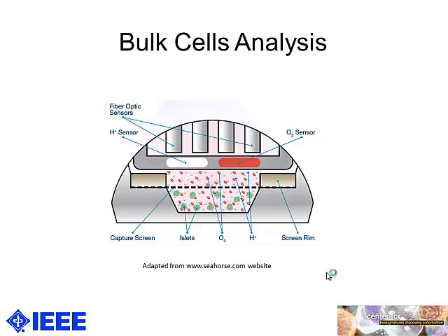This process is carried out with a large population of cells by measuring the parameters of the whole group of the cells and reporting the average value. However, it's really hard to address the inhomogeneous cellular response to the external stimulus because the measurement of the cellular response is lost in the bulk average.